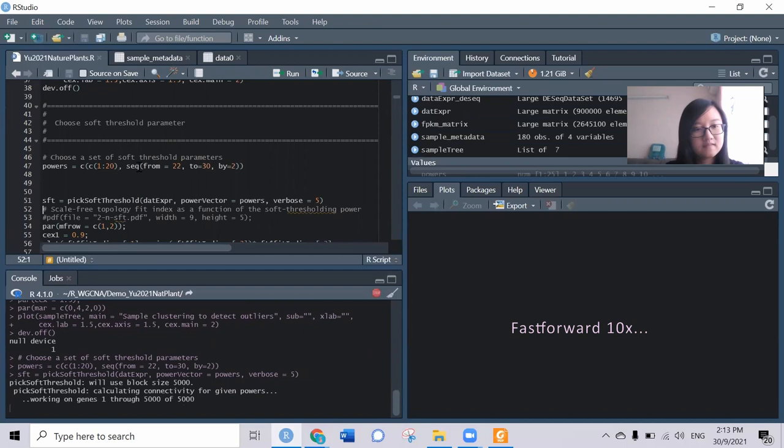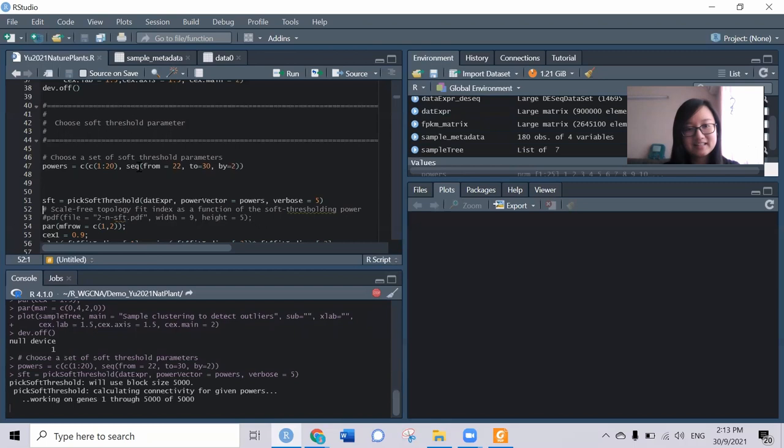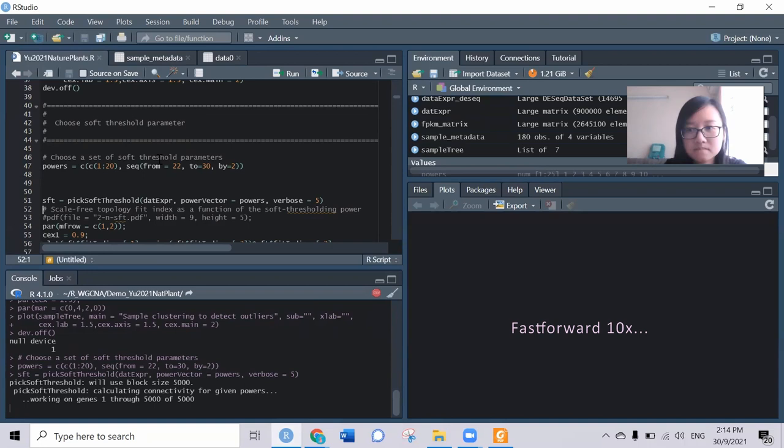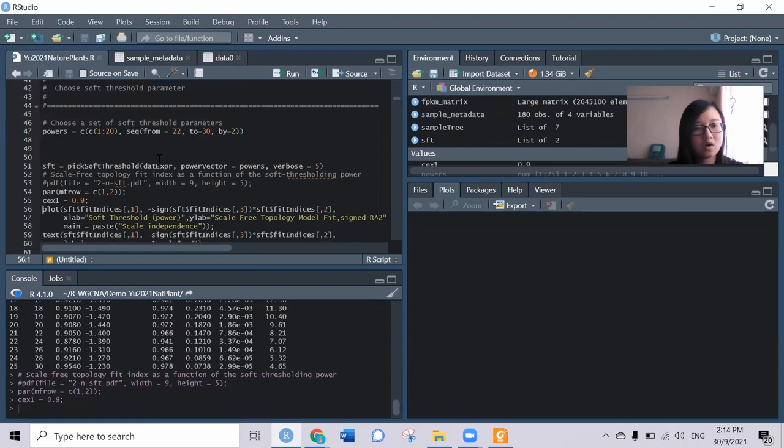It will take a while even though it's just 5,000 genes, so we can imagine how long it would be for the full data that may be 10 times more. Now we have the result and can try to plot the scale independence and mean connectivity plot.